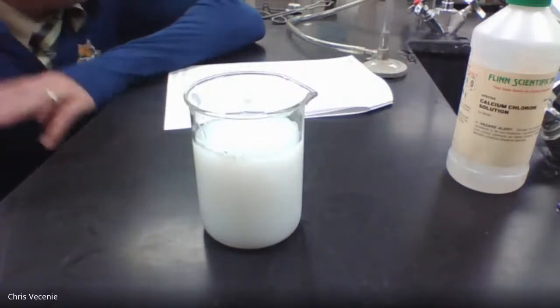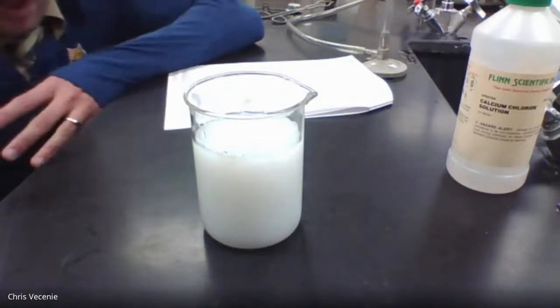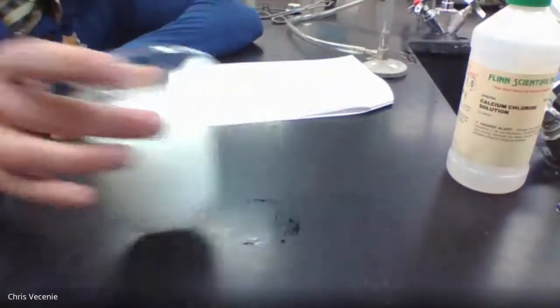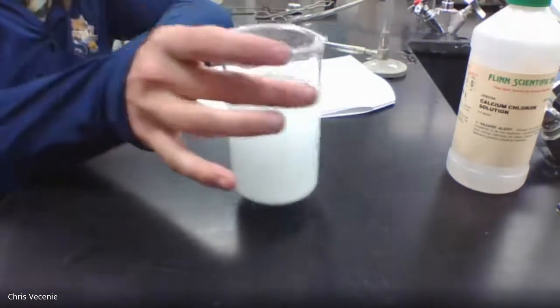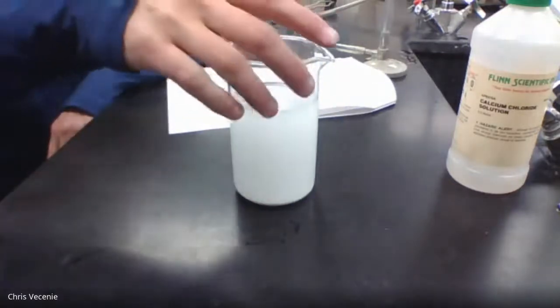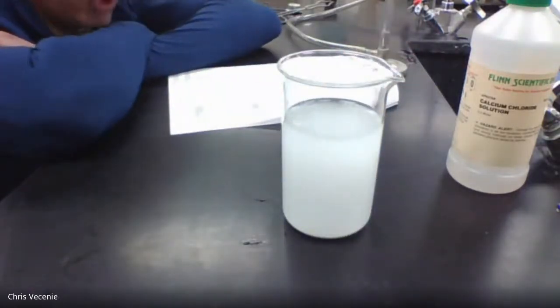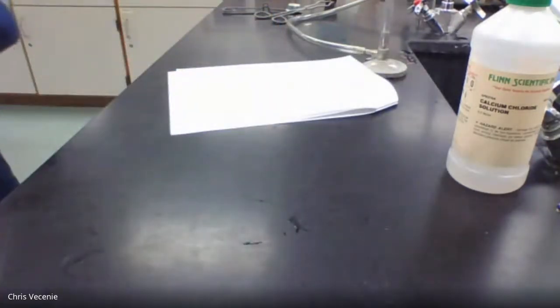All right, so it tells us to let that thing precipitate out for 5 minutes. This is where we can speed things up. Let's assume I've let that precipitate for 5 minutes. What it'll look like after 5 minutes isn't all that much different. Looks like this. We've got this still white solid that is starting to aggregate to the bottom. And now we're all about trying to retrieve that solid. So this is going to be over here waiting to be retrieved.